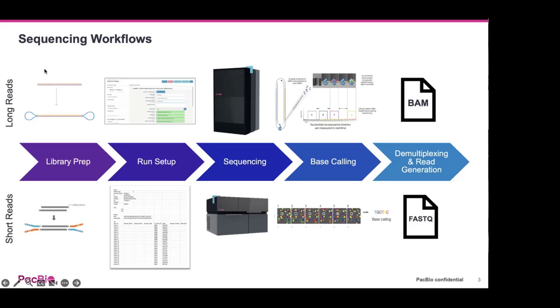Okay, so I've put together this slide. This has evolved over time, but it's a very quick, very high-level overview of our different sequencing workflows. For long and short reads, the technology for actually doing the sequencing is very different, but from a high-level workflow perspective, they're actually fairly similar. They share the same high-level steps. It's just the specific details that are very different.